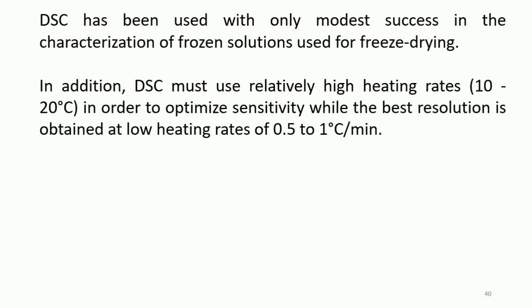Differential scanning calorimetry has been used with only modest success in the characterization of frozen solutions used for freeze drying. The reason is that there are numerous components and transitions happening within a narrow temperature range, and differential scanning calorimetry can only measure the sum of these.